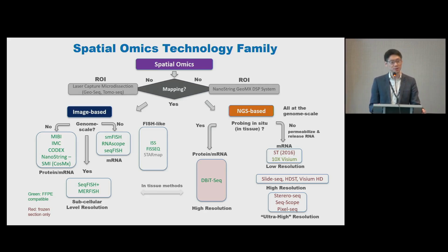Proteome-wide imaging probably is still challenging, but I would say about 10 years ago, if you did immunofluorescence staining, if you could look at 5 markers, people were really jealous. You were really the best in the world. I would like to work with you.